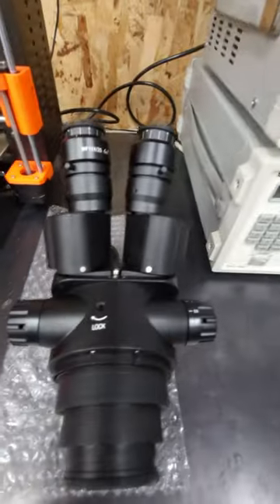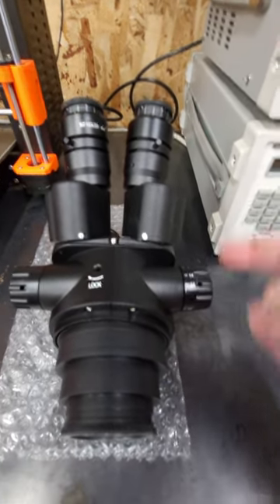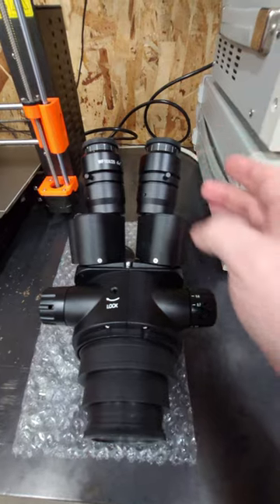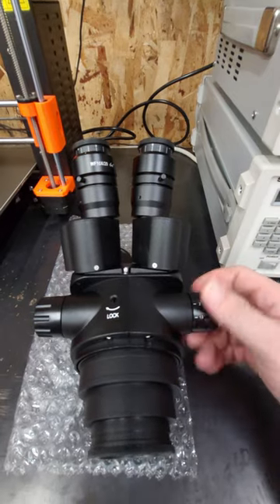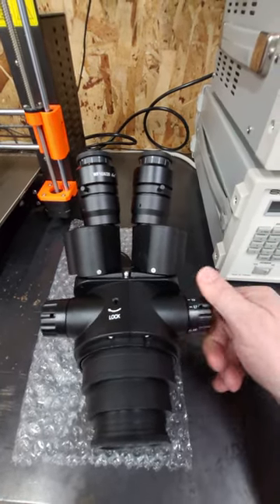Hey everyone, I'm back with this Amscope microscope head. A few things I don't like about it: the optical clarity, the diopters are loose so they don't stay where you put them, they're too close to your eyes so you have to back off to adjust them, and the zoom is really tight — it requires too much force to zoom in and out.